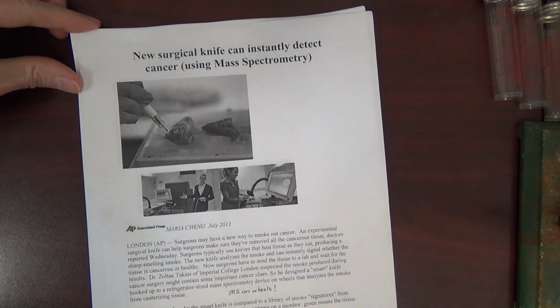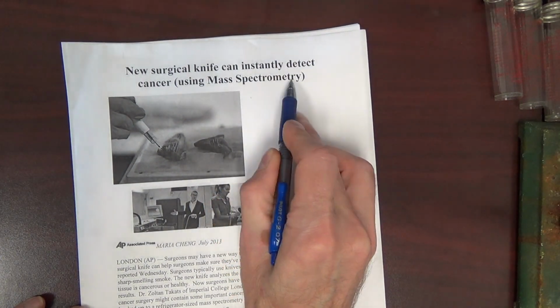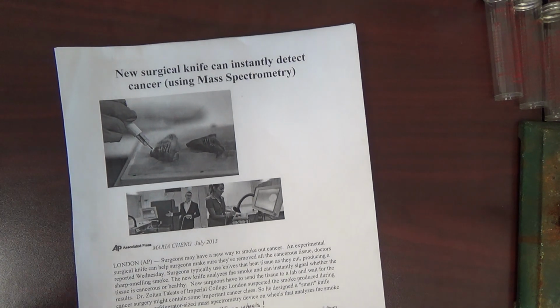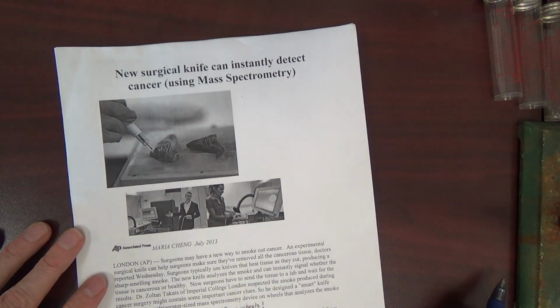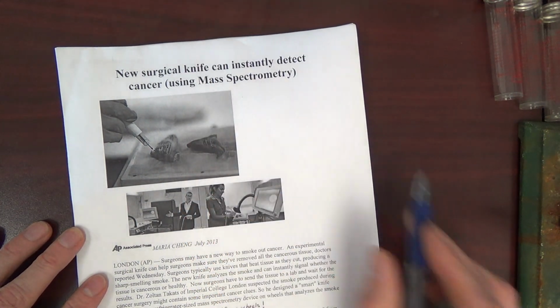Hi guys, in this video we'll be looking at mass spectrometry. Notice that it is spectrometry and not spectroscopy. Spectroscopy is where you use some type of light or some type of electromagnetic radiation such as IR or UV-vis or even X-ray. In mass spec we do not use light, and so it's more appropriate to just call it mass spectrometry. We do produce a spectrum. Now this is typically shortened to just mass spec.